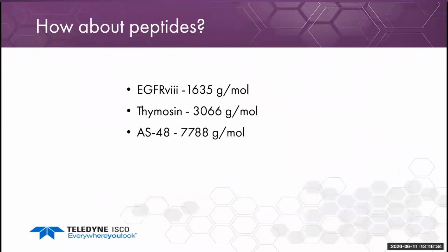But what about peptides? These peptides are used for the rest of the presentation. They range from about 1600 Daltons, a small peptide similar to a small molecule, to AS48, which is almost 8,000 Daltons.